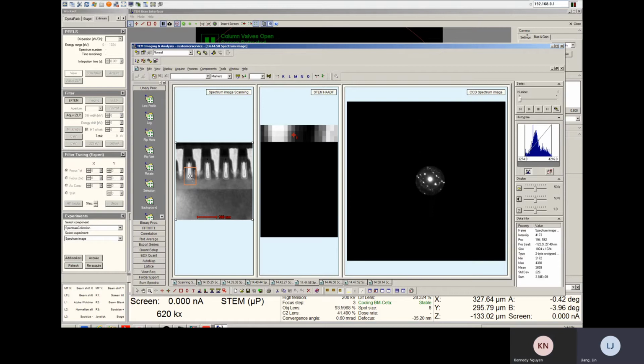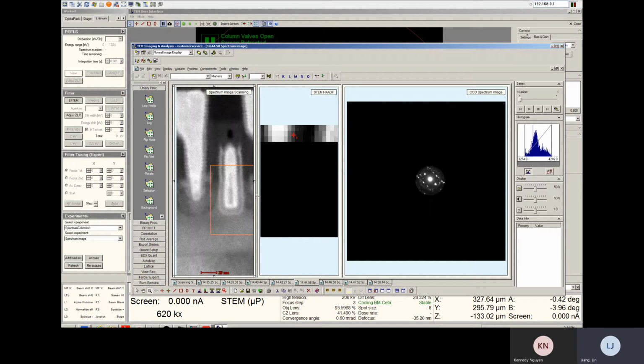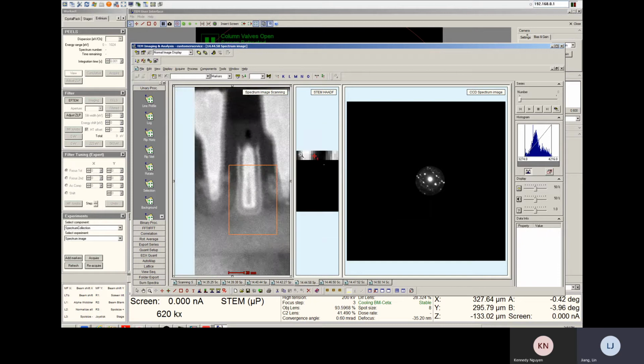Once you get all the mapping, you still get the pixel here, and you can correspond your diffraction imaging with this image. This image is going to be a blank image, but within the blank image you're going to have pixels. Then you can correspond the pixel in the middle image to the left image because they have similar pixel size.